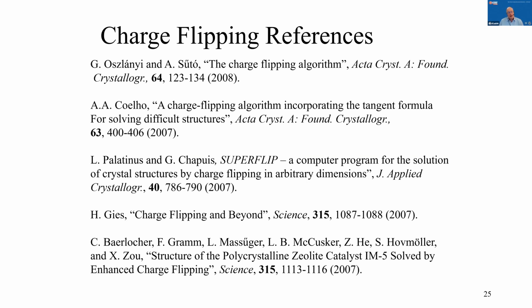Have a new electron density map, back transform that to get a new set of structure factors, amplitudes, and intensities. Throw away the intensities because we think we've measured those, but use the new phases and keep repeating the process until it converges. And how can this possibly converge? But it works, and has been used to solve some quite complicated structures.